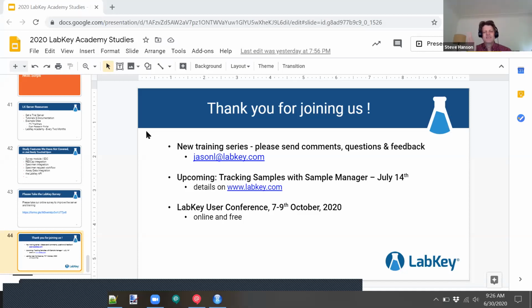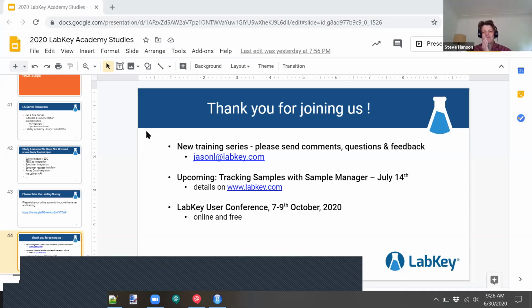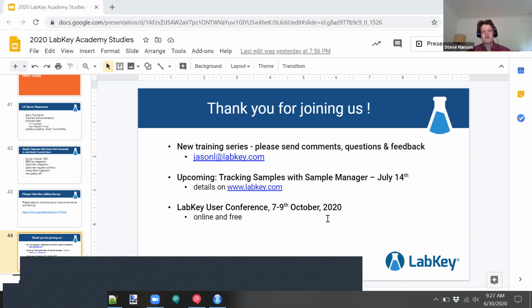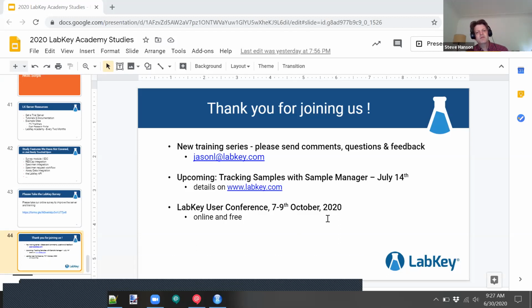Great. Thanks again, everybody. And again, I really recommend people look at that LabKey user conference. This is a huge resource. I'm going to be doing 8 hours of these kinds of presentations. It's really just the best way in to LabKey Server to get your head around it, because it's such a huge piece of software with so many features in it that we haven't even touched on.